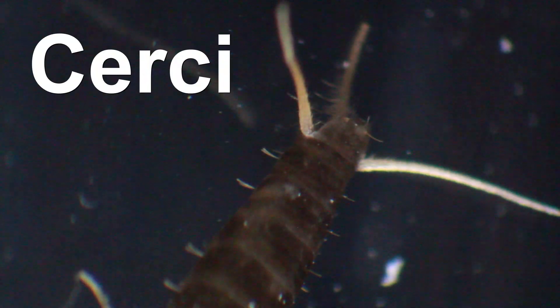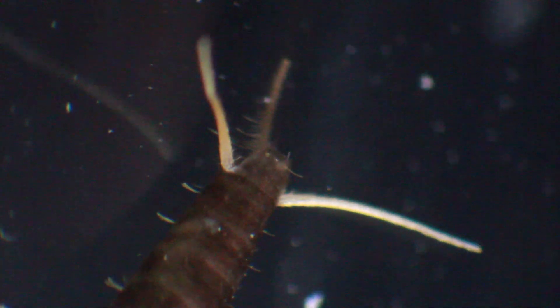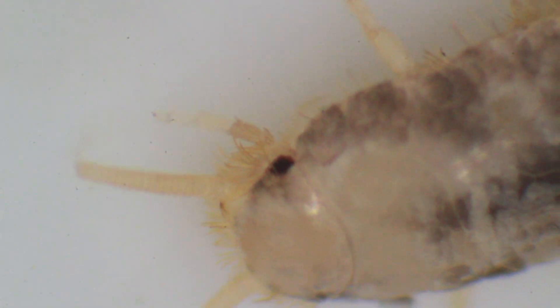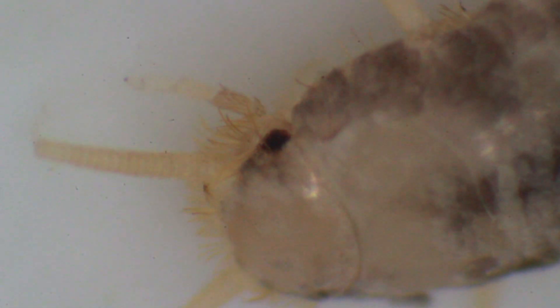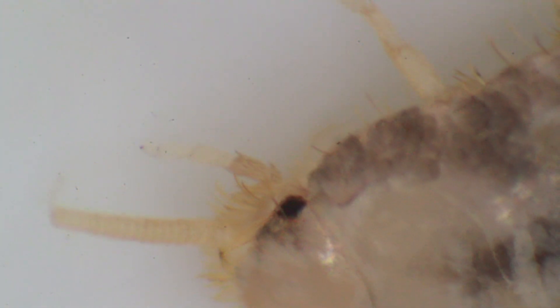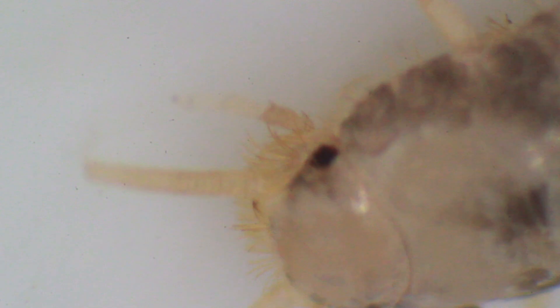Here you can see the two cerci much better. And wow - that's nice - here is one of the compound eyes of the silverfish. I think they are very interesting and very cute animals, and well worth putting under the microscope.